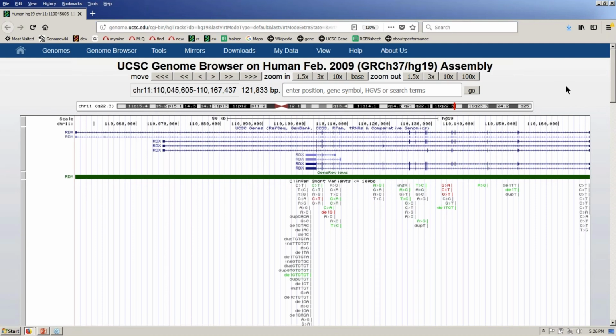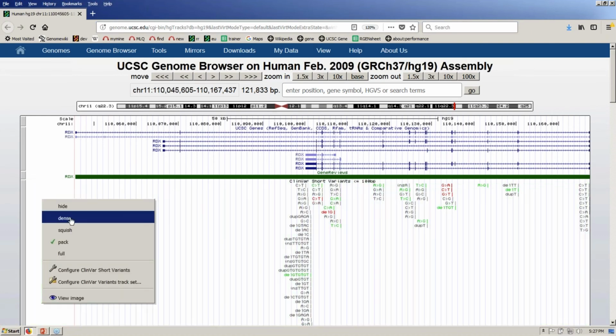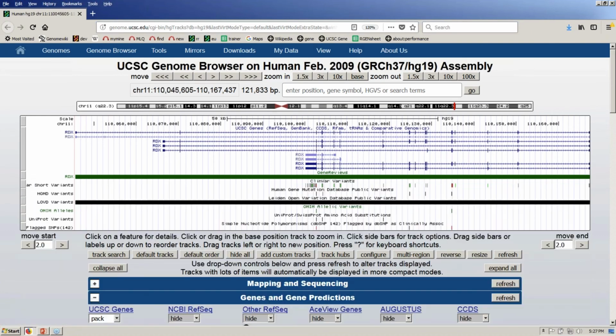And that's true of all of our tracks that are in a typical bed format that allows you to see the label. Whereas under dense, you might be interested just in seeing where the annotations are rather than caring about the label. So I'll leave the other 3 quadrants of that representation on the other page to you to click around in, and you can see that each one of them will load data sets that are relevant for the particular quadrant that's represented there.